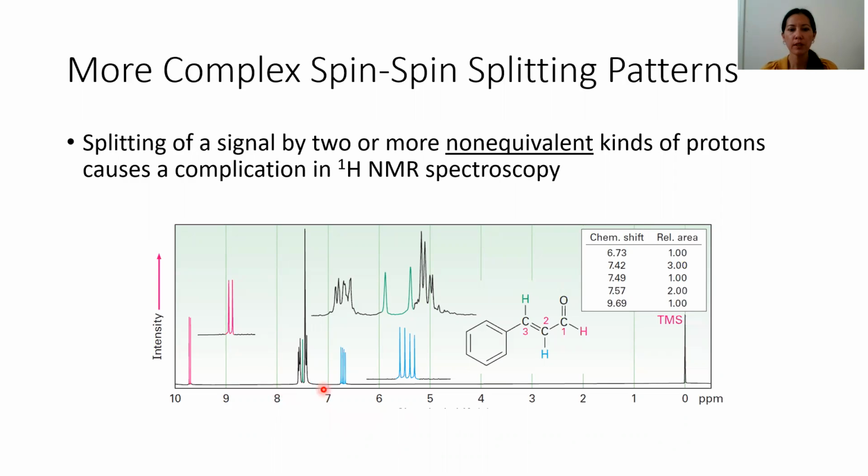So here's an NMR spectrum. You have a doublet here, a little before 10. You have this more complex splitting pattern, which is characteristic of this phenyl ring here. You also have a peak within the 6 to 7 range. It's blown up here to show there are 4 peaks, but it really isn't quite a quartet, is it?